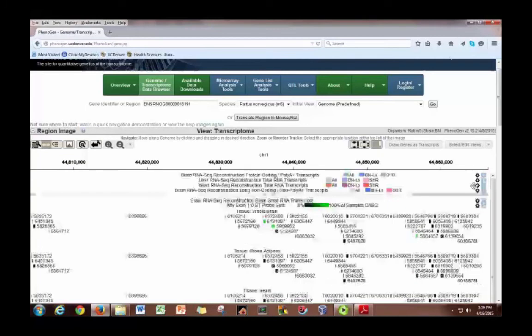the default here is going to show you my RNA-seq reconstructions. We took RNA-seq data from these tissues and did a genome/transcriptome guided reconstruction. We basically looked at our data and asked what's being expressed, and can we draw a transcript that matches the expression we're seeing, also using information about what's already been annotated? So we had brain RNA-seq with poly A, and there's nothing there. That means this particular gene didn't show up in our poly A fraction. Liver, there's nothing. Heart, there's nothing. But brain, there is a good transcript in there.